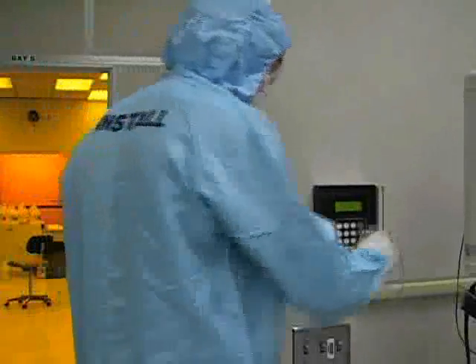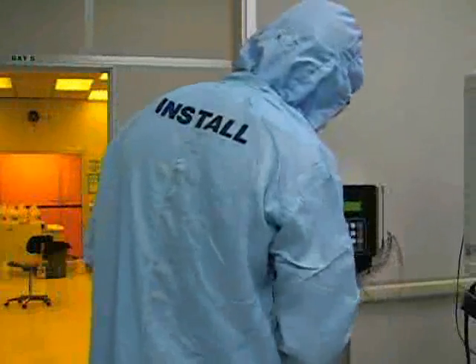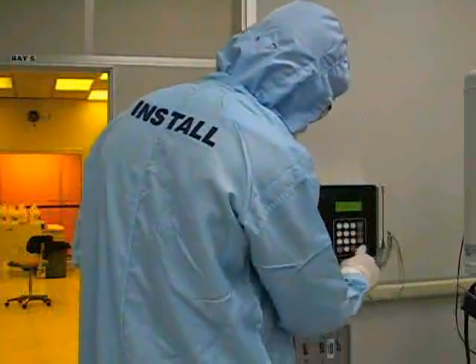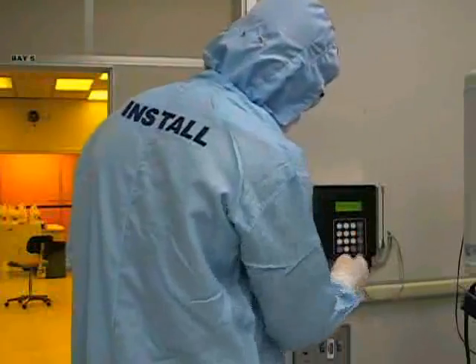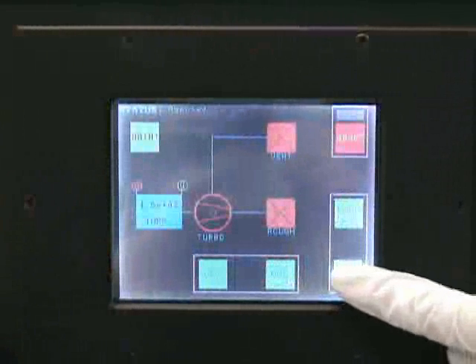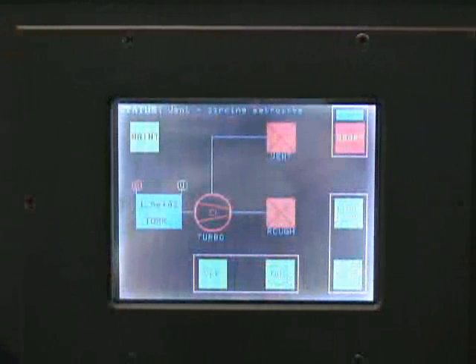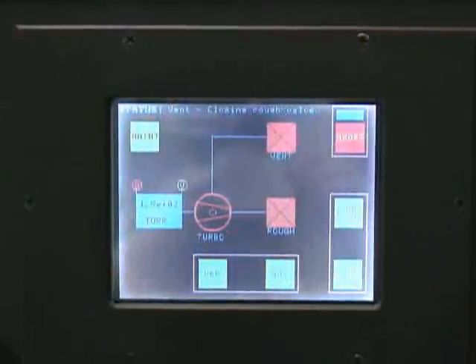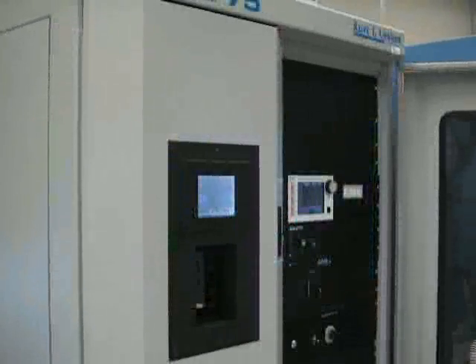Before you are able to use the PVD-75, you must first log into the system at the access controller. Once you are logged in, you should begin preparing your sample for processing. While you are preparing your sample, you should begin venting the system. Press the vent button on the front panel touch screen to initiate the chamber vent sequence. When the touch screen displays vent complete, the chamber has reached atmospheric pressure and the door should be able to open.